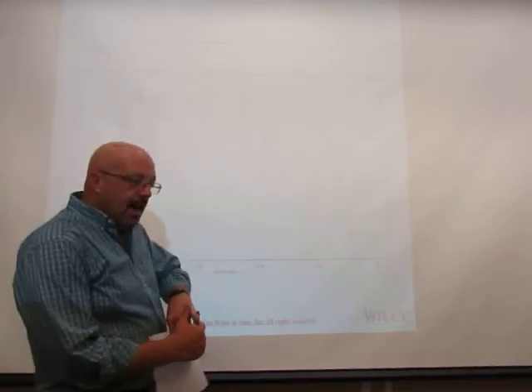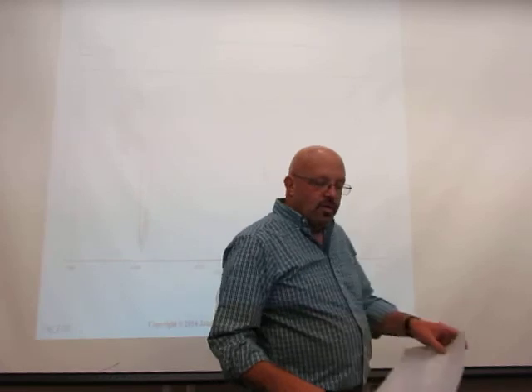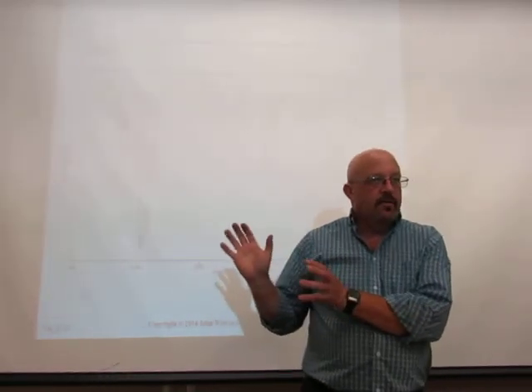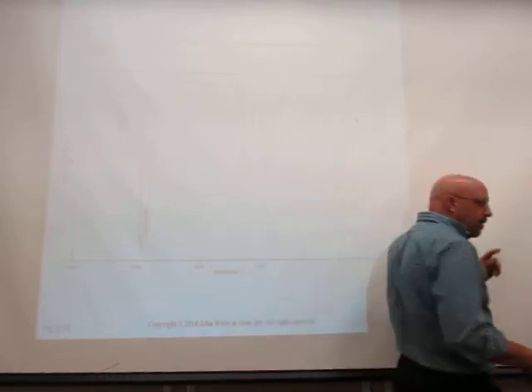Typically medium in intensity. And if you have a primary amine, that will show two NH stretches. Just like we saw with the amide. So that part's the same. Of course, the amine doesn't have the carbonyl like the amide does, so we don't get to see that C double bond O, so you can tell the difference in them.